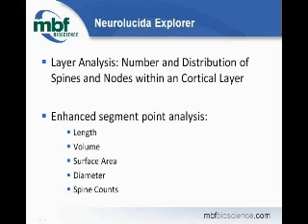Windows XP can use version 10. There's no reason it can't. You may run into issues if you want to do something very data heavy and memory intensive, like manipulating many images in the 3D visualization window. But if that's the case, you know the solution is to get a faster computer.